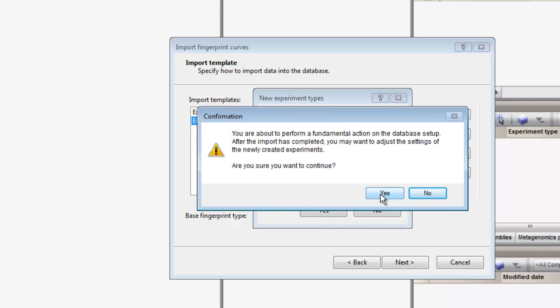A warning pops up saying that I am about to perform a fundamental action on the database setup. This action will be the creation of new fingerprint experiment types. Please note that you need administrator privileges to do so.